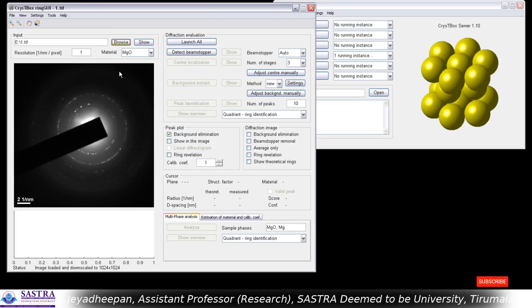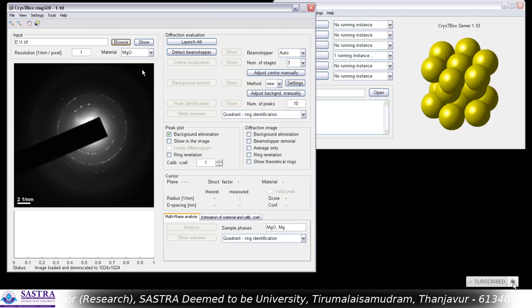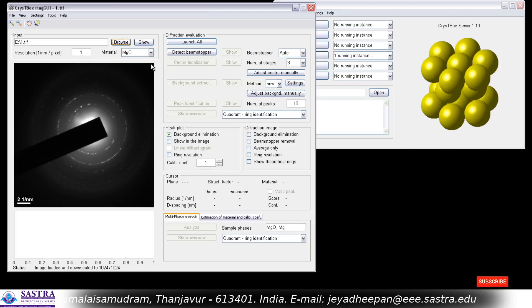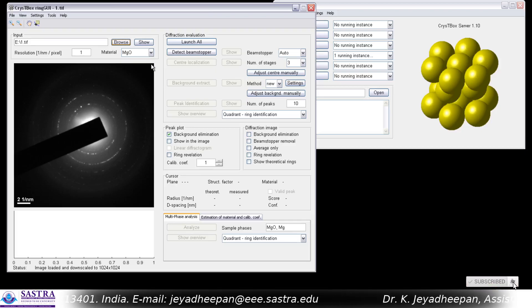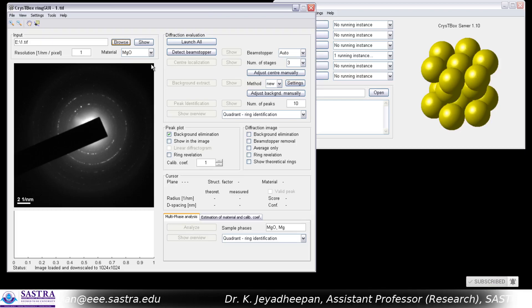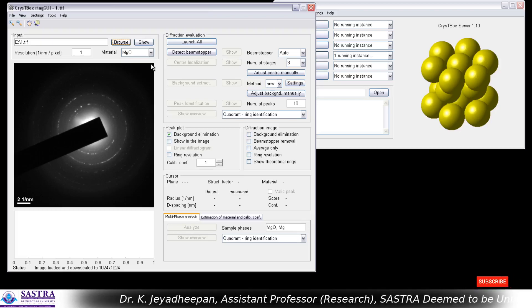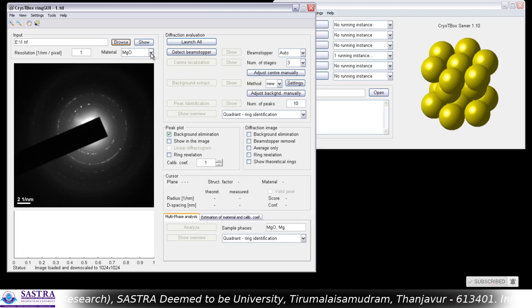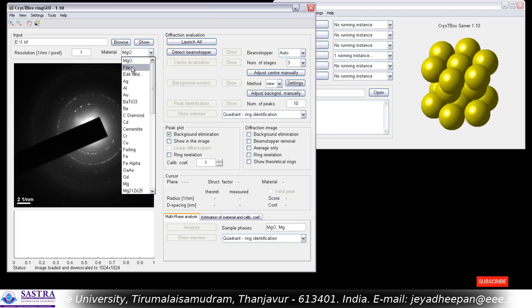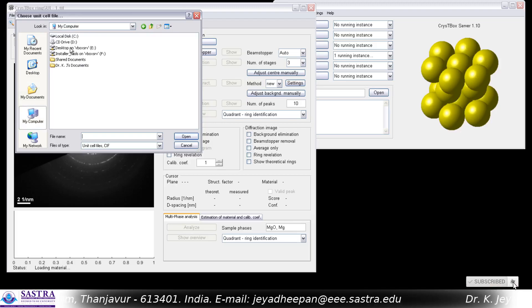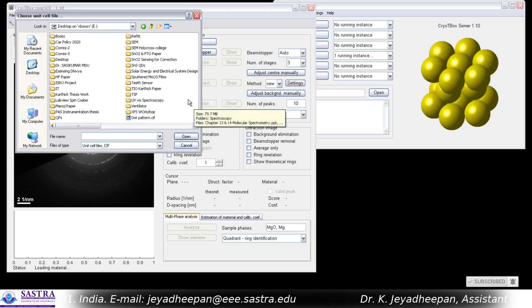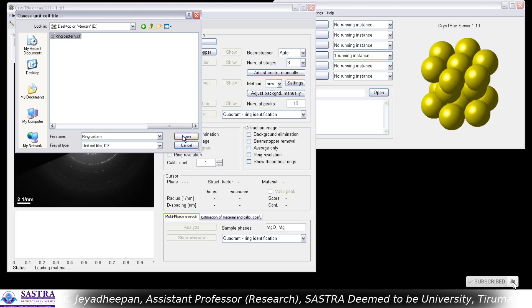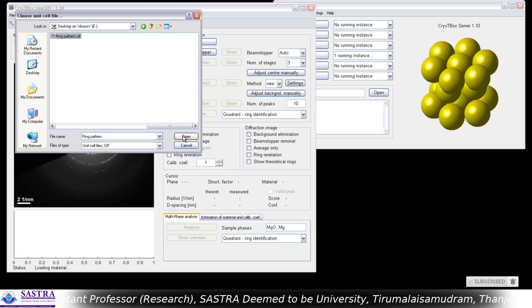We also have to add the reference database file — that is the crystallographic information file (CIF) — which we have downloaded from the AMCSD database or COD database at the end of the basic X-ray diffraction analysis. You have to open that crystallographic information file from here. Go to File and open the file. Here this is the ring pattern CIF file — 'ring pattern dot cif' — which is the file we are going to use for this analysis.